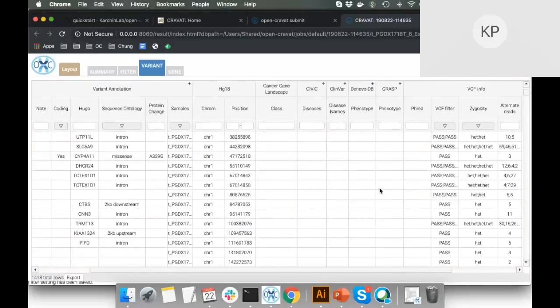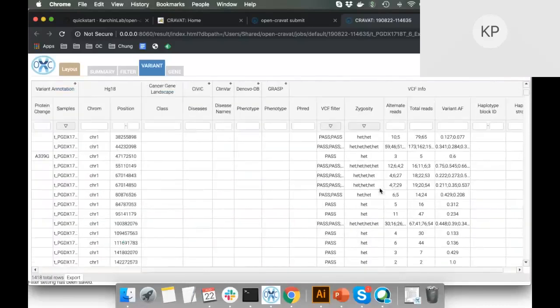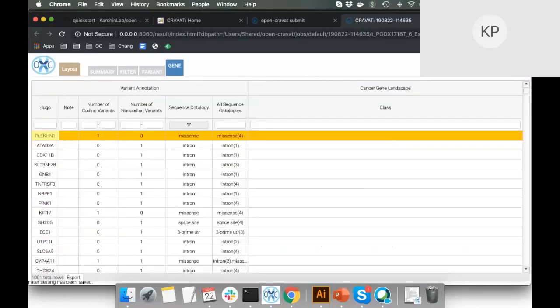That way you can allow widgets, for example, something like IGV, to truly dominate your screen if that's what you're interested in. If you want to load in, for example, a BAM file to get some more context among several individuals, same thing here. And then save it. And that's the interface.